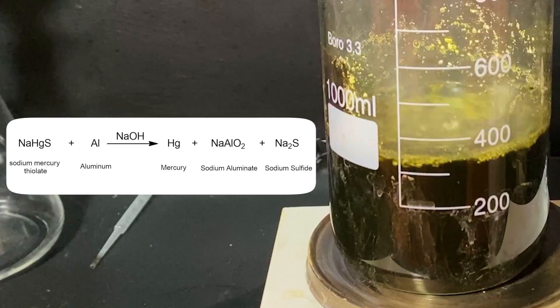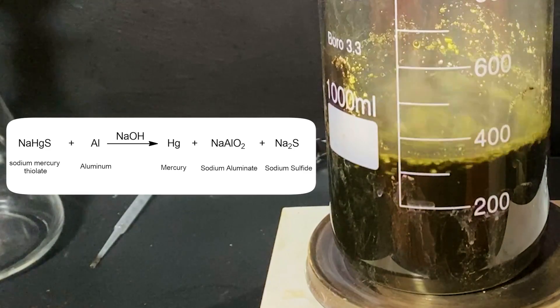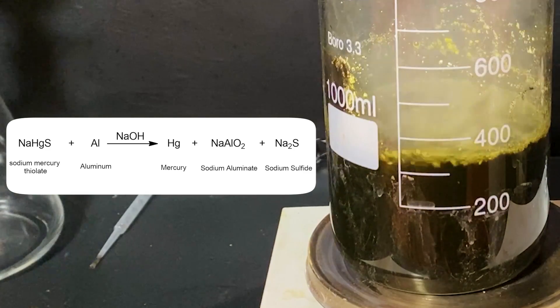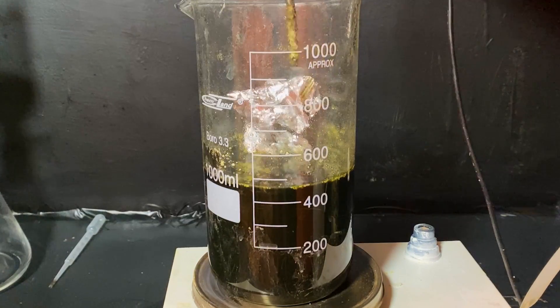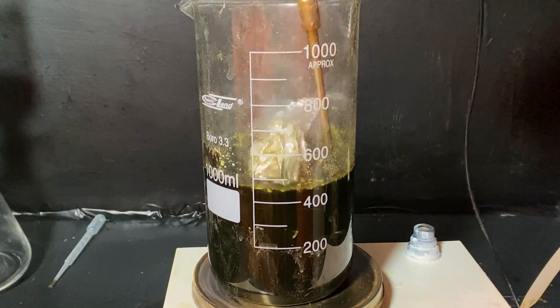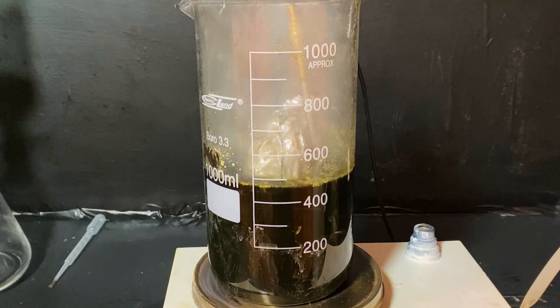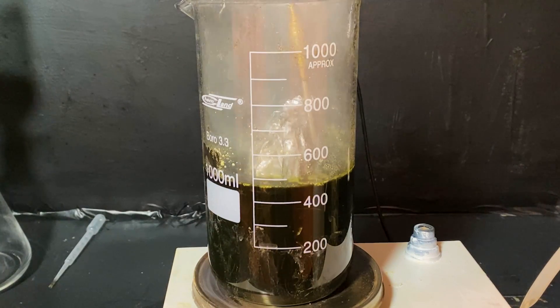As the major reaction here, the mercury sulfide complex reacts with the aluminum metal to form mercury metal, sodium aluminate, and sodium sulfide. Once the mercury complex is exhausted, the next major reaction is the sodium hydroxide reacting with the aluminum metal to form sodium aluminate and hydrogen gas.